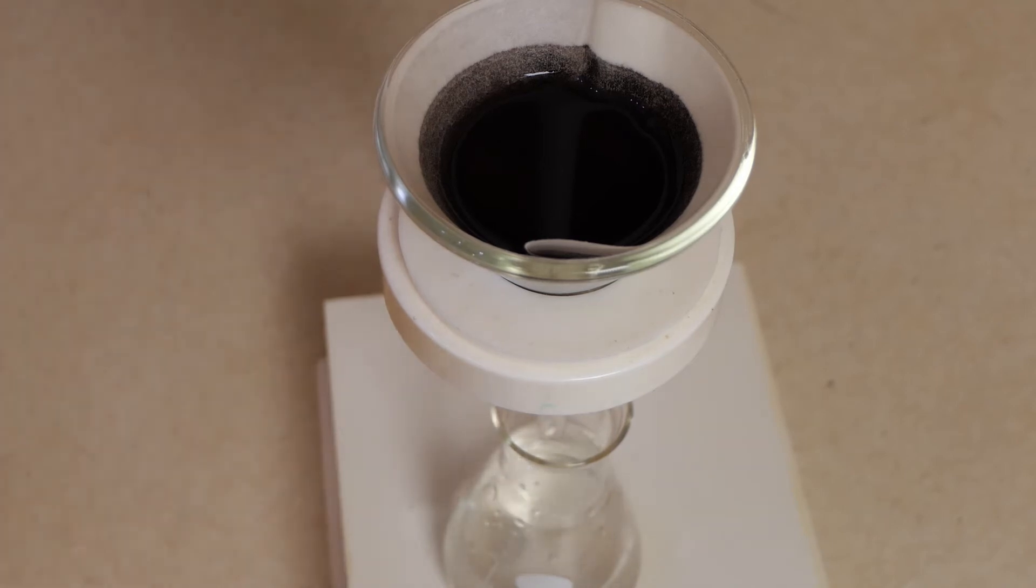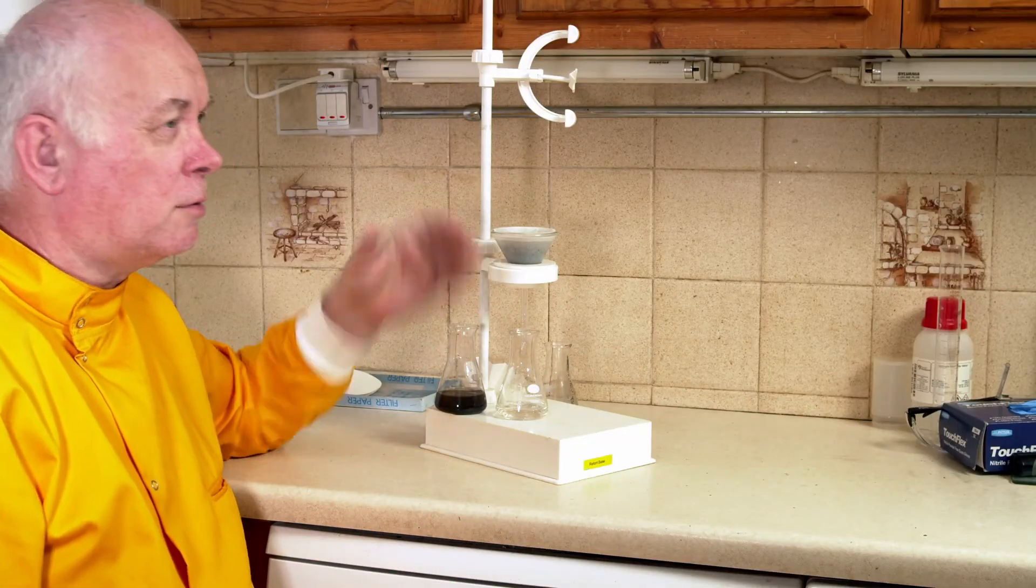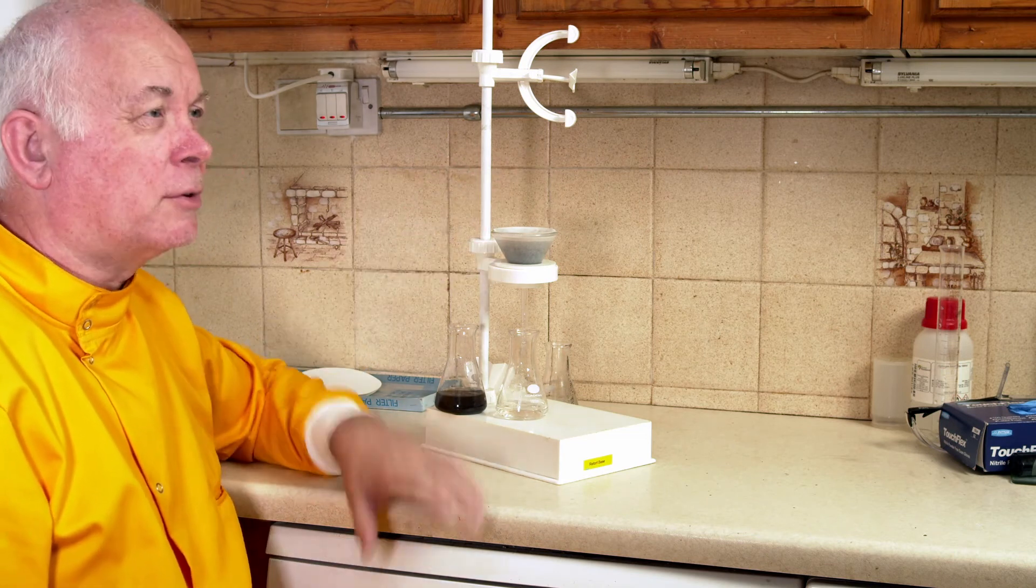In fact in this experiment it's the manganese dioxide I want to recover because it's poisonous and we don't really want to shove it down the sink and it's a catalyst. There's nothing wrong with it, it's just been used once so by filtering it we can put it on the filter paper then I can dry the filter paper and we can recover most of that back and use it again and again and again.